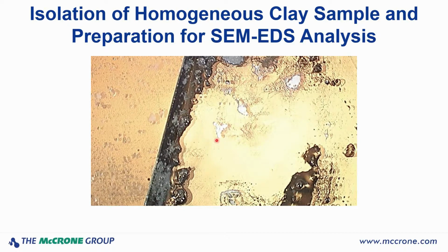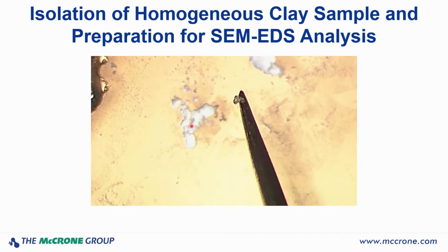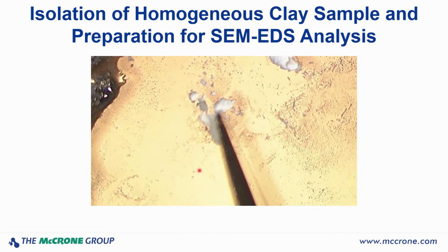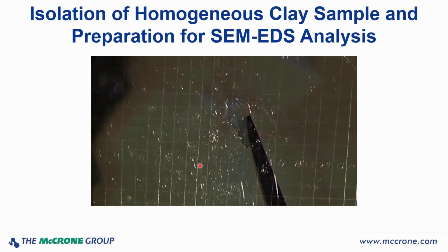Now we come back over to our slide. Here's our sample. We're using oblique illumination now, so our particle looks white instead of brown. There's my adhesive on the tip of my tungsten needle, and I pick that portion of that particle up that we want to look at. Now we're going to move that out.